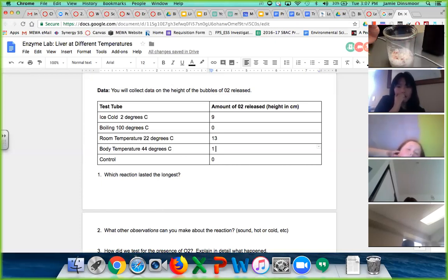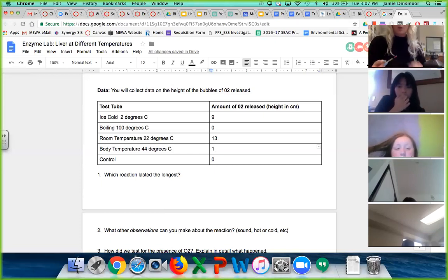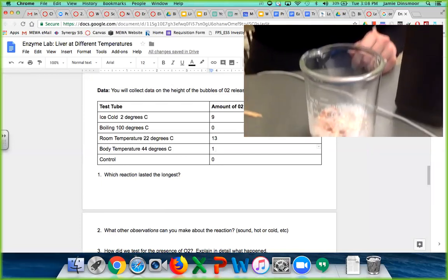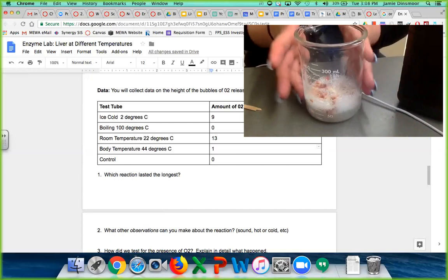Were you guys able to see that on the video? I don't know if you were able to see it really well. But basically what ends up happening is the ember kind of lights up and then the stick reignites on fire, which is pretty cool. Yeah, the video is really tiny. Actually, you know what? We can make it bigger. I'm gonna have to get a new stick because that one's getting real short. Let's see. I can do this. There we go. Now it's much bigger, right?